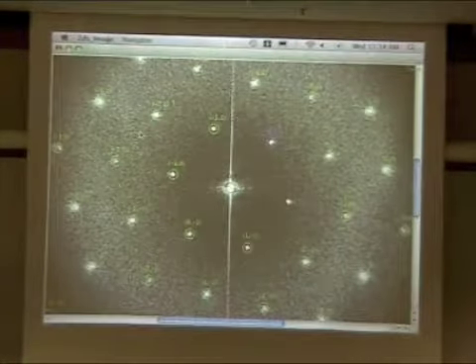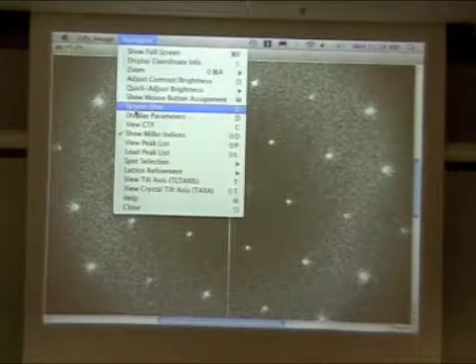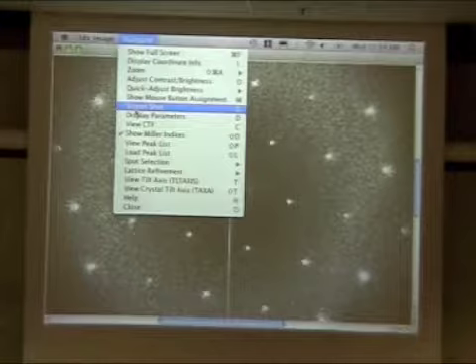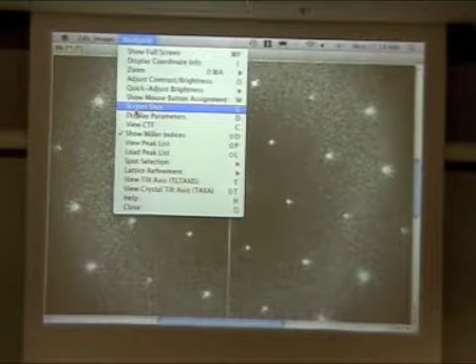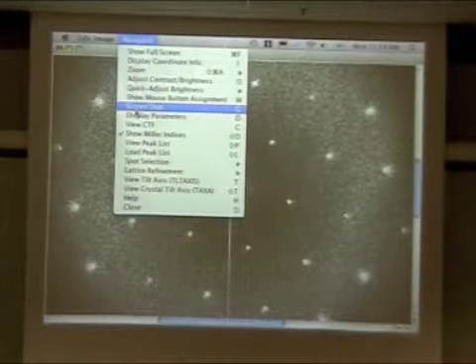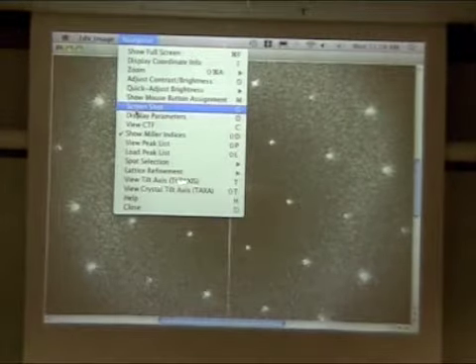It's kind of interesting. One I added a while ago was this screenshot ability. This takes a fully qualified screenshot of the entire viewable region, not just the viewable on the screen, but the entire image, and saves it to screenshot.png in your home directory. Might be slightly different on Linux, maybe saves it to a TIFF or so. You can also view the taxa.